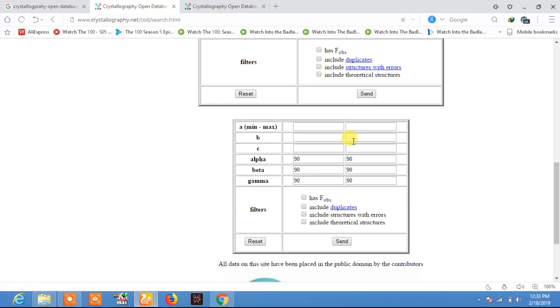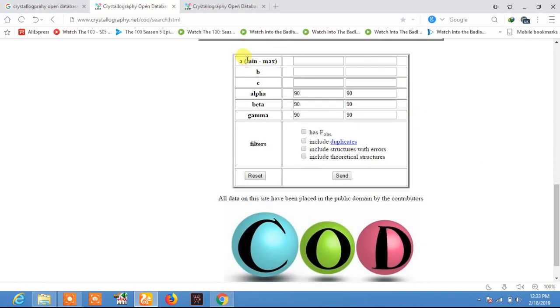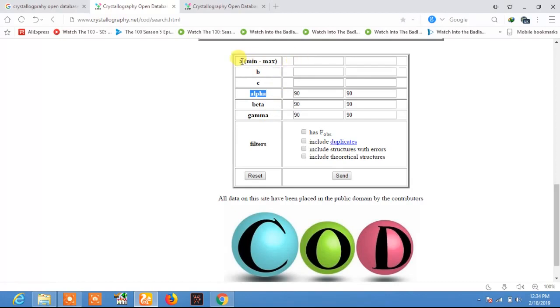If you know the specific structure of the element, you can search it on the COD database using the fourth method. In this method you need to give the A maximum and A minimum. A, B, and C are the lattice spacing or lattice parameters, while alpha, beta, and gamma are the angles between these lattice parameters. I am going to search for the TiC crystallographic information file using the lattice parameters.